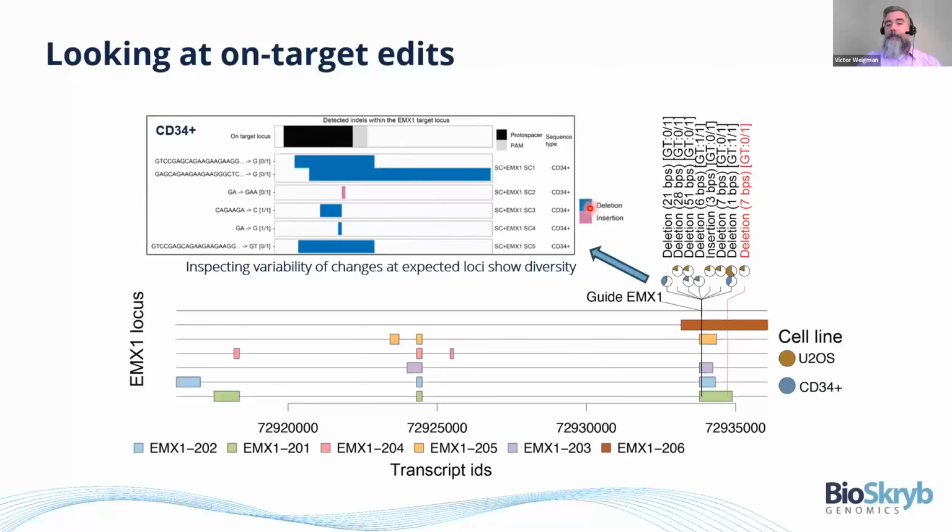Throughout the presentation, deletions are going to be in blue and insertions are going to be in pink. Okay, well, that's how it looks for CD34. What about the other cells?